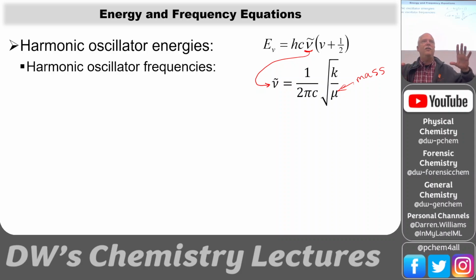In the infrared spectrum, that fingerprint region, that's the bending motions of the light atoms and the stretching motions of the heavy atoms all on top of each other. And so that's why that part of the spectrum is so confusing. We can get out to the CH stretch, and there's really nothing happening around 3000 except CH stretches, or maybe NHs or OHs. So the OH, NH, CH stretches are easy to identify and talk about in the infrared. But when you get to the fingerprint region, it gets confusing.